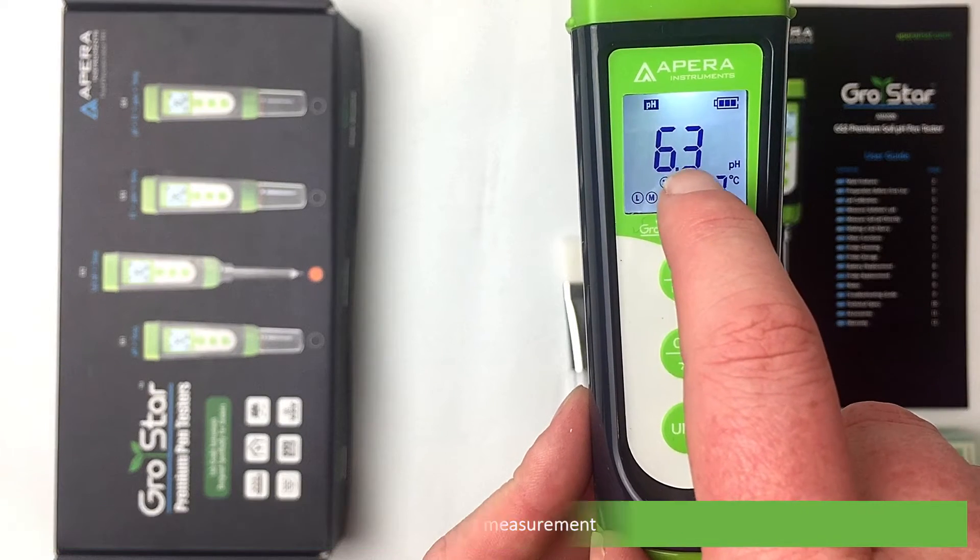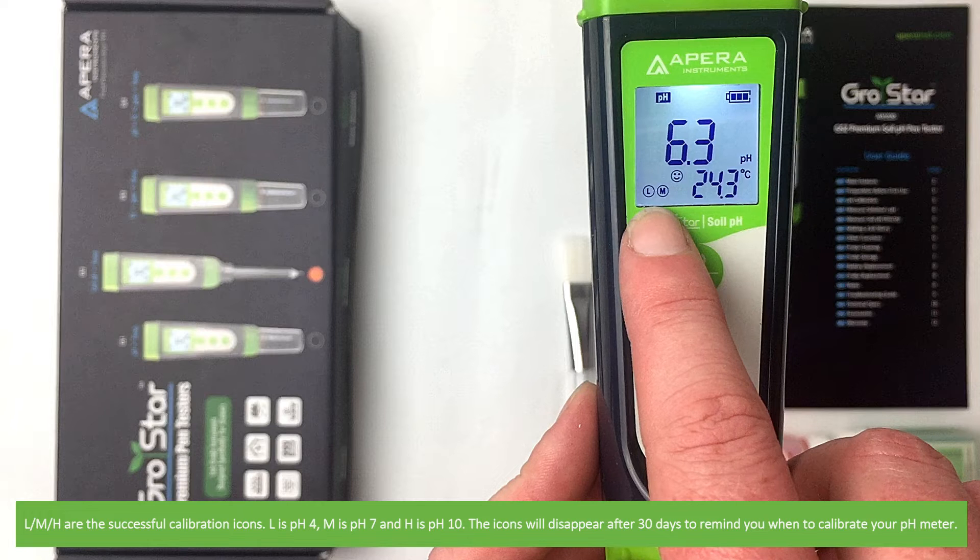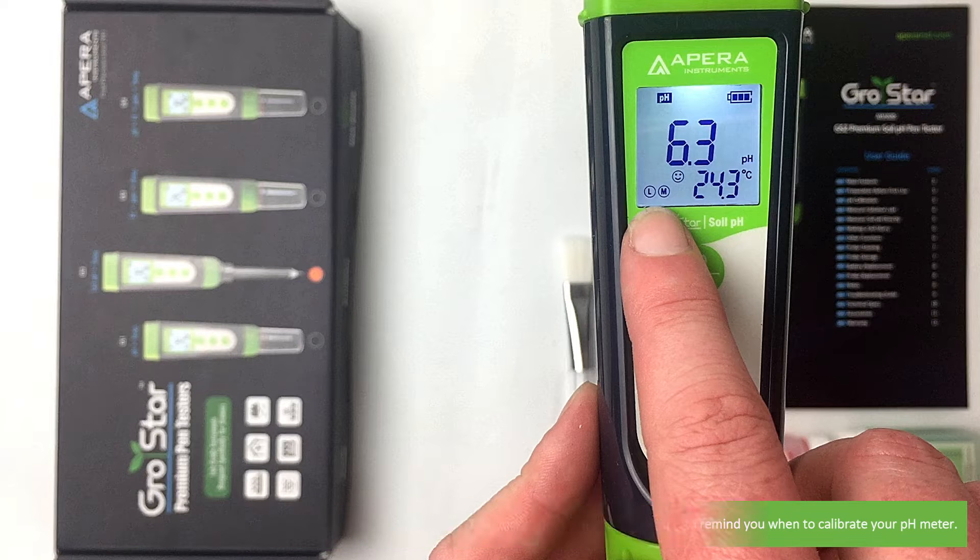L, M, and H are the successful calibration icons. L is for pH 4, M is for pH 7, and H is for pH 10. The icons will disappear after 30 days to remind you when to calibrate your pH meter.